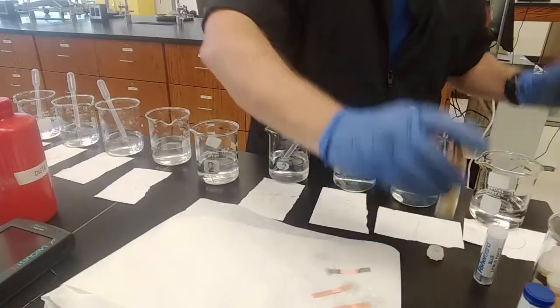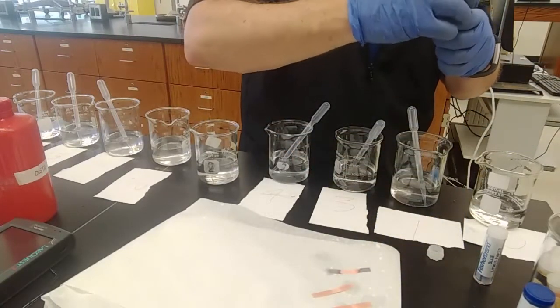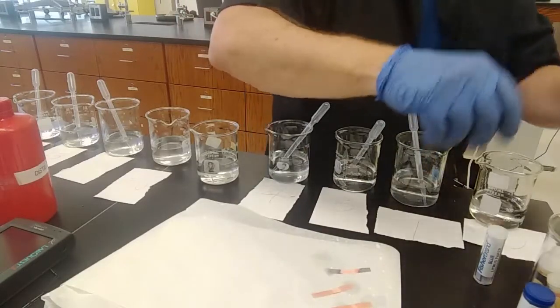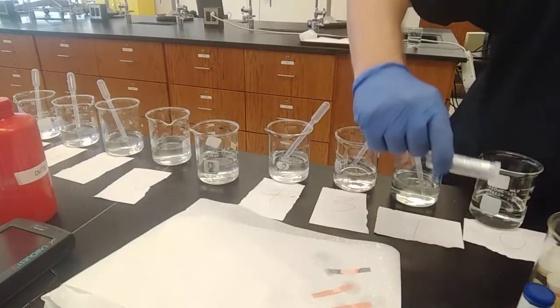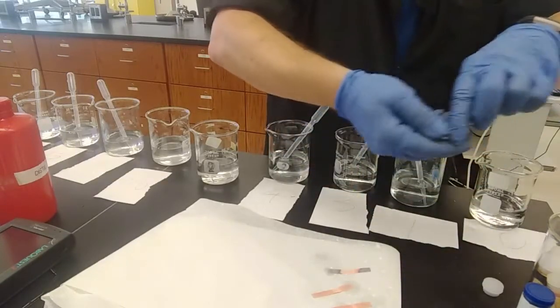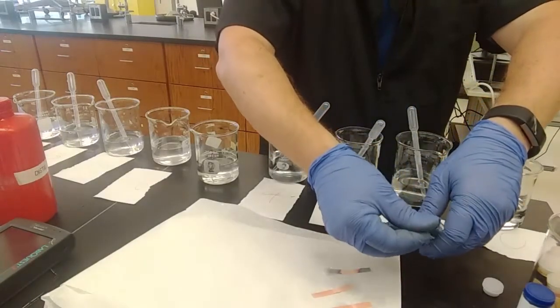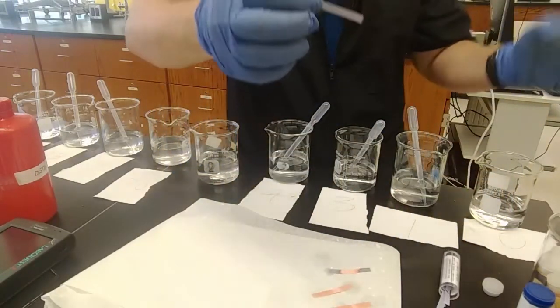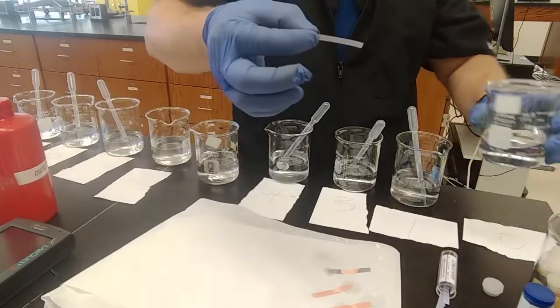Let's, because we can, confirm yet again with the blue litmus paper. Got a bunch of that here. We'll go in the same order. I have blue litmus paper. If I dip it in base, it shouldn't change. If I dip it in acid, it should change.